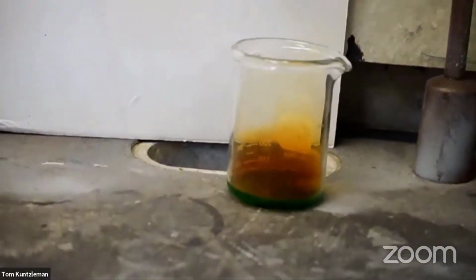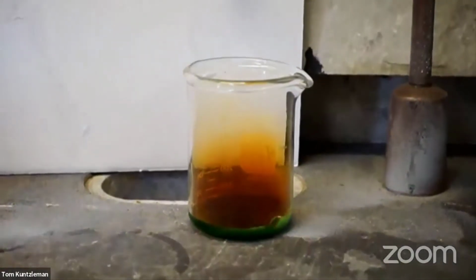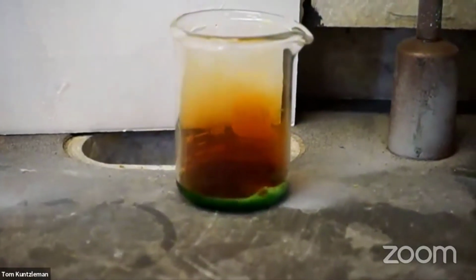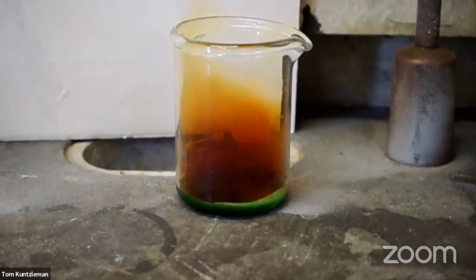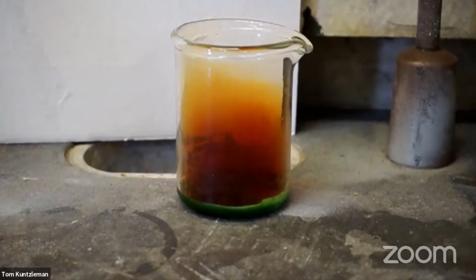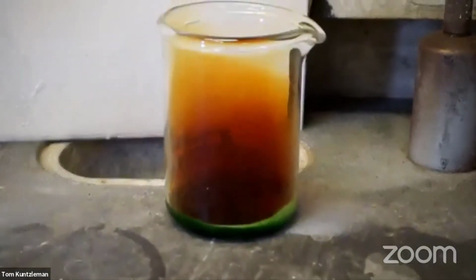There we go. Yep. If need be, we'll slide the screen down a little bit. Man, I see some orange gas coming off. I see bubbles. I see some green stuff. Well, there's a lot going on there.